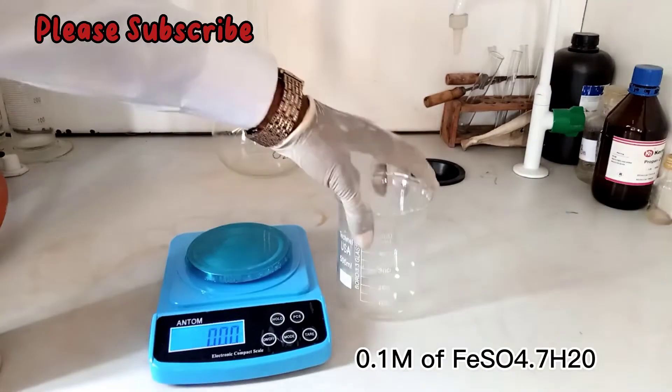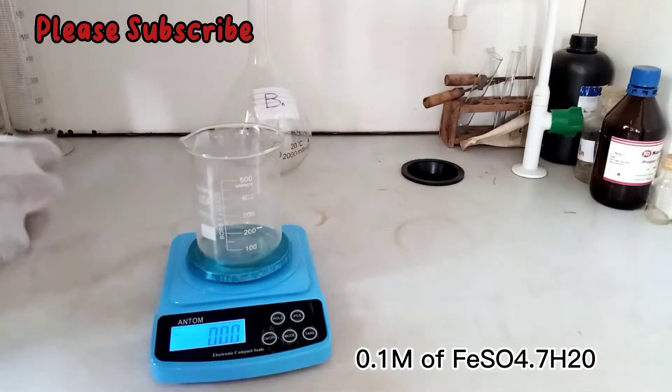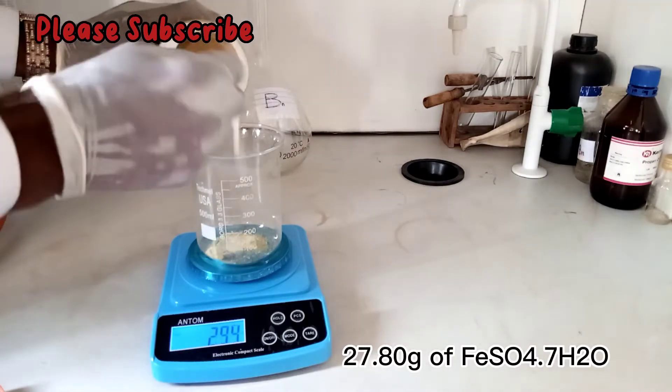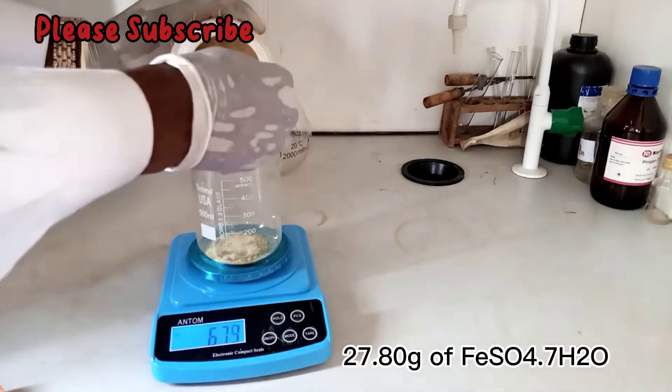Here is how you prepare 0.1 mole of iron sulfate. First we weigh out 27.8 grams of iron sulfate.